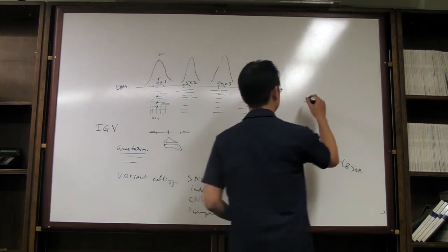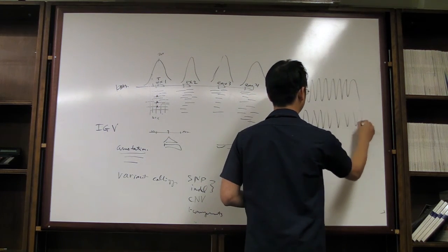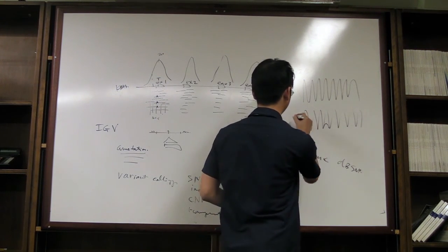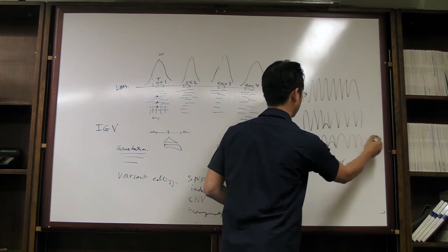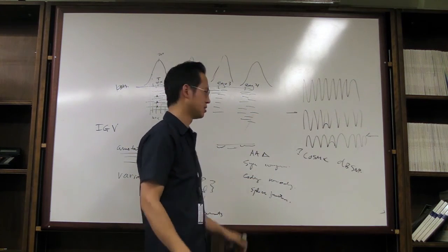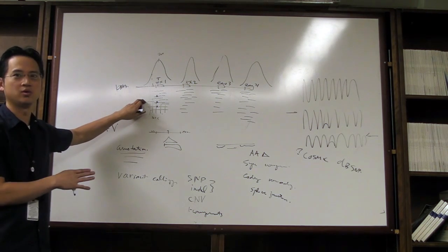Traditional sequencing is, you have your blips. Sorry, it's monochromatic today, but here's your mutation. And you say, oh yeah, there's something different from reference. I see it in the forward direction, and in the opposite direction, you see it in the reverse direction, and then I call my mutation. This, you can visualize if you want, but if you deal with 5 million bases, you let the computer do that part, right?